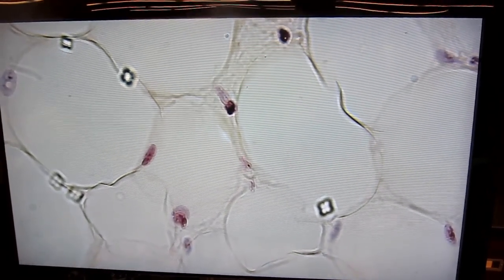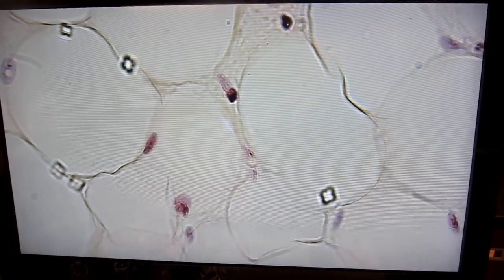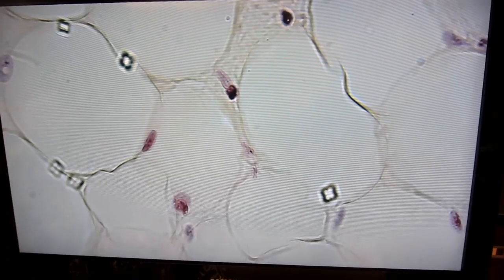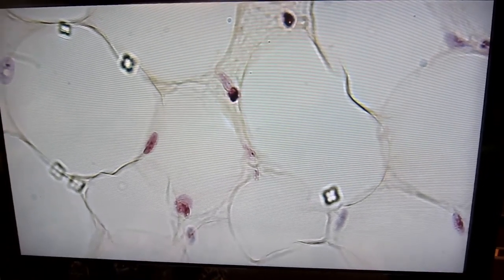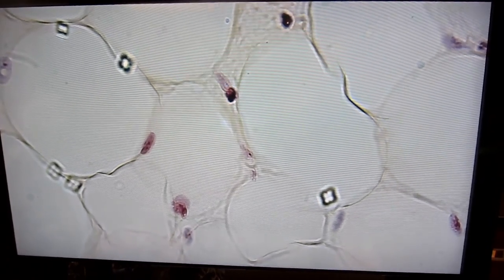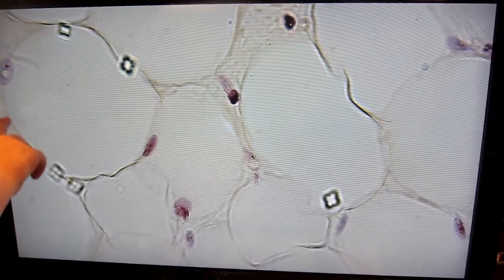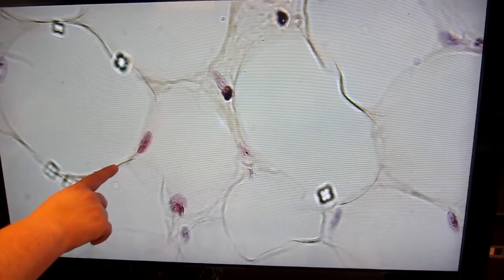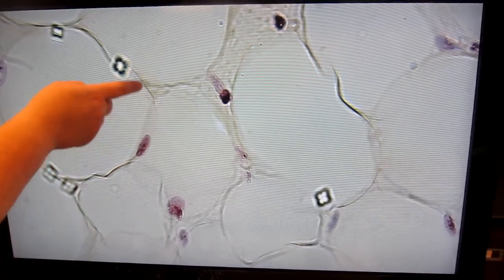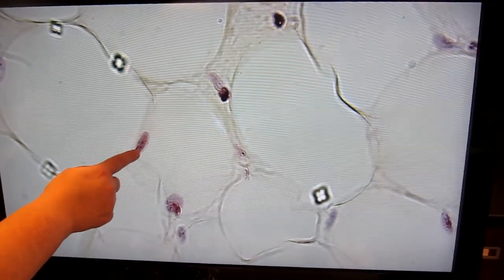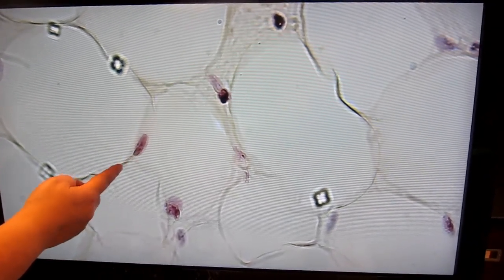The reason I'm pointing this out is because sometimes people will confuse adipose tissue with simple squamous epithelium in the lung, which we looked at a little while ago. Remember, when we were looking at the lung specimen, the alveoli had lots of nuclei all the way around. Whereas here, no nucleus except for the one associated with the actual cell.